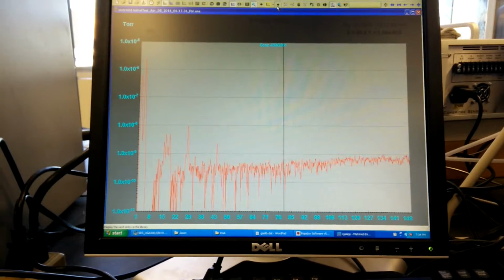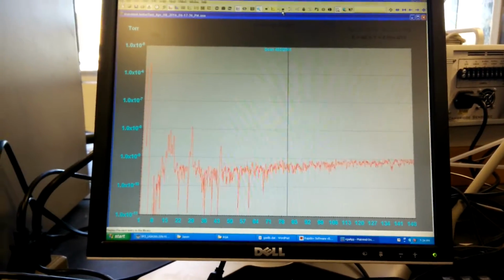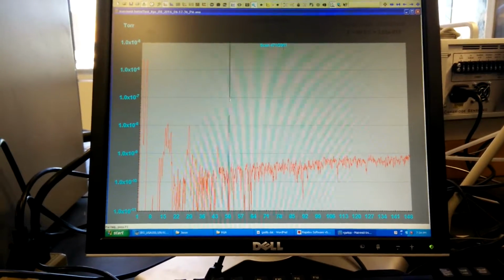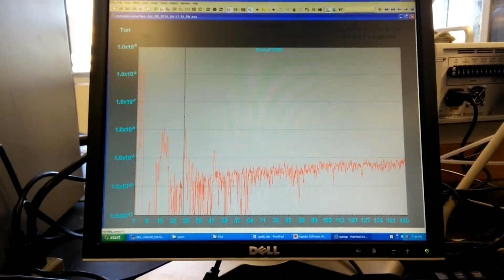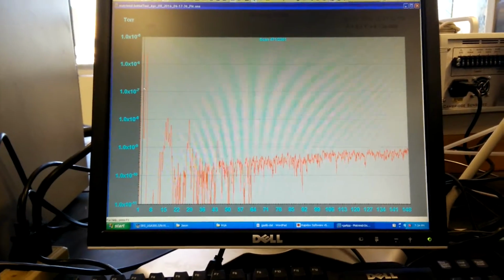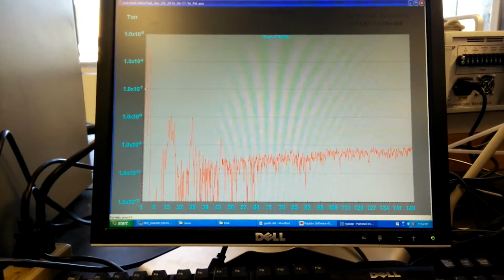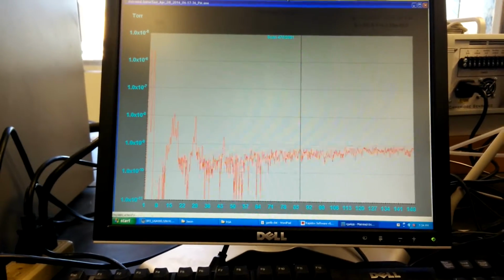But now the temperature is starting to rise again, and once again we're seeing a huge increase in the methane, the CO2, and now we're actually starting to see a very clear amount of hydrogen cyanide gas forming, and this is at about 700 degrees Celsius. We also see a large amount of hydrogen starting to form a little bit over 700 degrees, approaching 800 degrees.